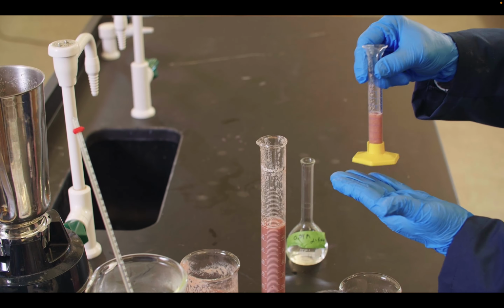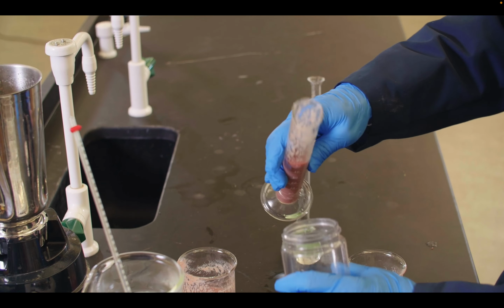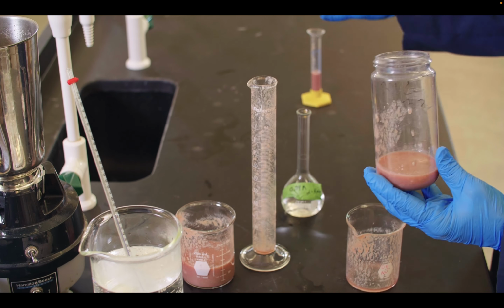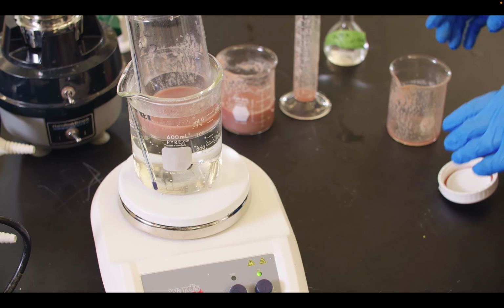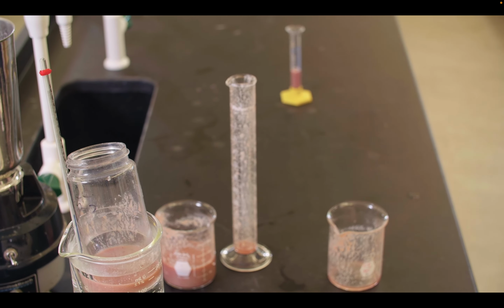Now we're going to take 5 milliliters of that, and we're going to keep that back, and do some experimentation with it. But the rest of FR1, fraction 1, we're going to pour into this 250 milliliter centrifuge container. Again, the total amount is 75 milliliters for fraction 1. We keep a portion of it to do some experiments with, and this one we're actually going to heat up. We're going to put it into this water bath, which we already have set to 70 degrees Celsius, and we're going to heat it for 20 minutes, in the presence of this alpha-ketoglutarate, which is going to be able to stabilize.